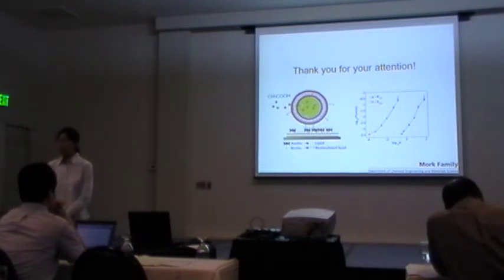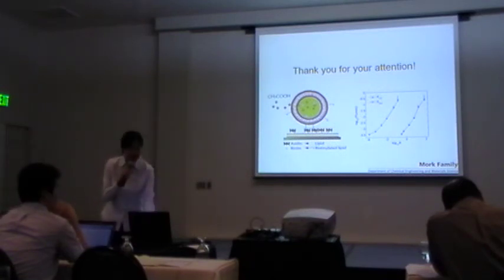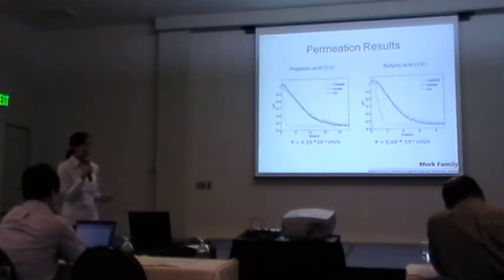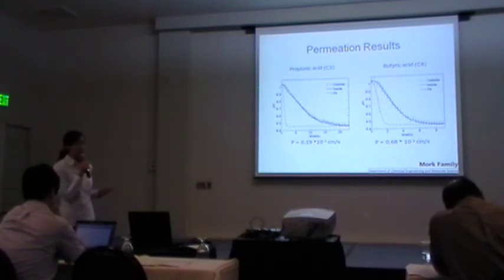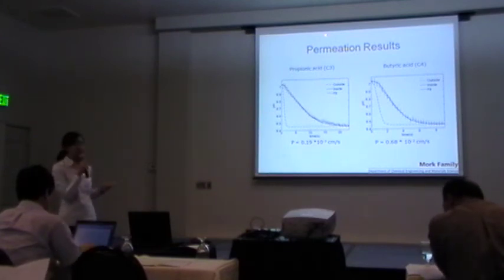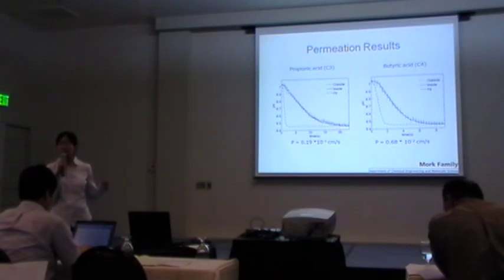Would you explain how you measure the membrane permeability? To measure the membrane permeability, we first track how the internal fluorescence intensity changes, and then by tracking the intensity change rate, we can convert this intensity to the acid concentration change, and this is the experimental data.